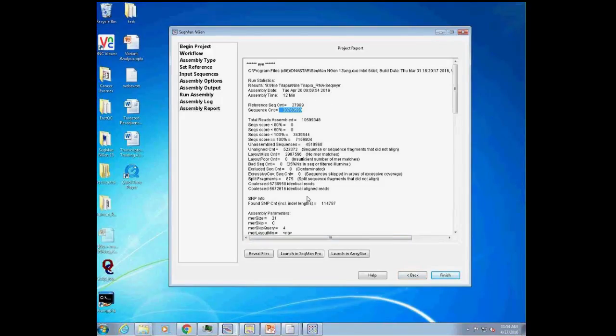a minimum of 3. And if you have replicates, then a common thing is a t-test. The t-test will look across the samples at each gene and essentially normalize it across the multiple samples. So in some cases you may see a high degree of variability between samples. Sometimes you don't. So about half of my customers say they really don't see that much variability, so they don't invest in more replicates. They might invest more in more coverage on a transcriptome.